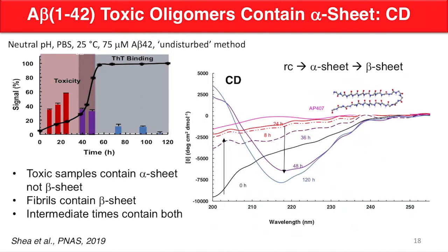So then in the next slide, we wanted to characterize this structure. So we went back to circular dichroism, and we expect, based on the alternating chirality, to have essentially null signals for alpha sheet structure. So we want to see if we get alpha sheet structure, going back to our 15-year-old hypothesis, if we're seeing alpha sheet structure in the lag period when the toxicity peaks.